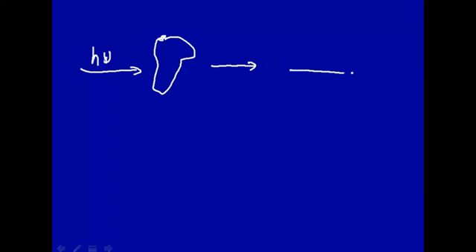And what we'll find, if we look at the spectrum, this is energy on this axis, is that we get the light at the same frequency coming in. Let's call this h nu 0. So this would be the light that just went right through the sample and didn't interact. But what you'll find is you'll have some lines on this side, and then you have the mirror image over here on this side.